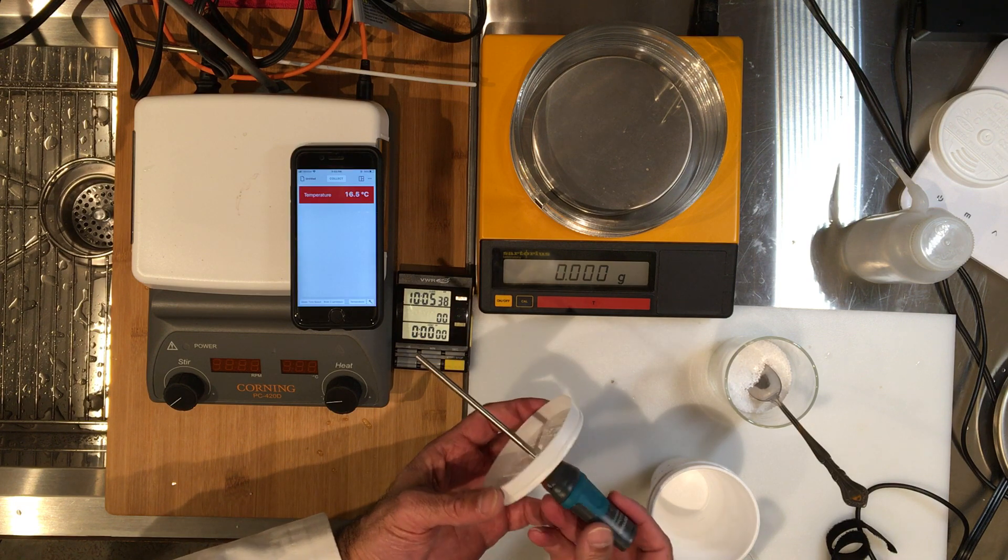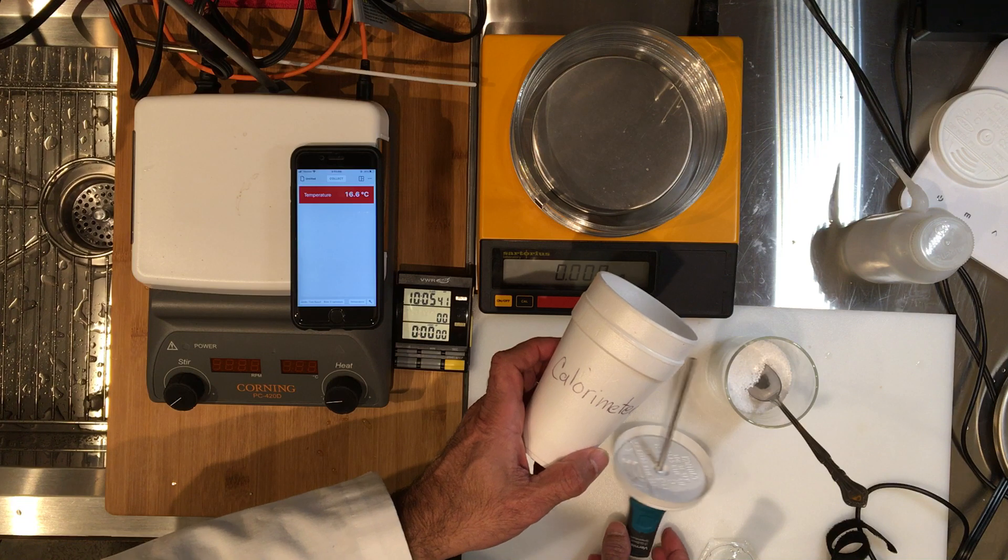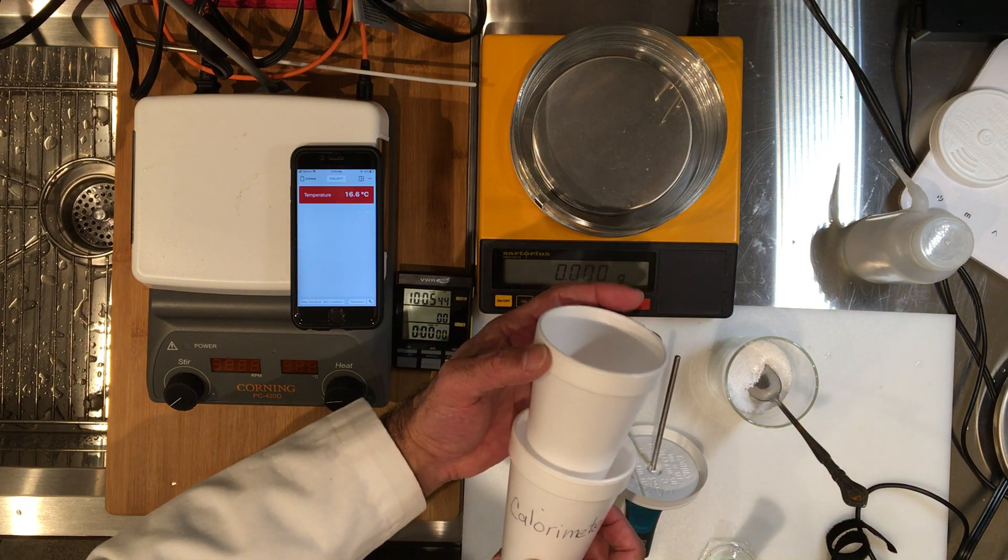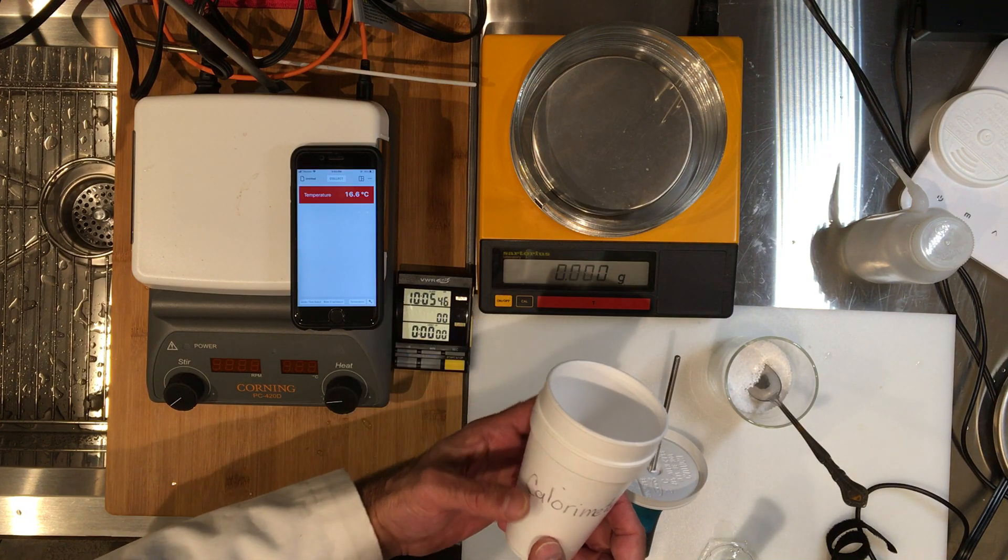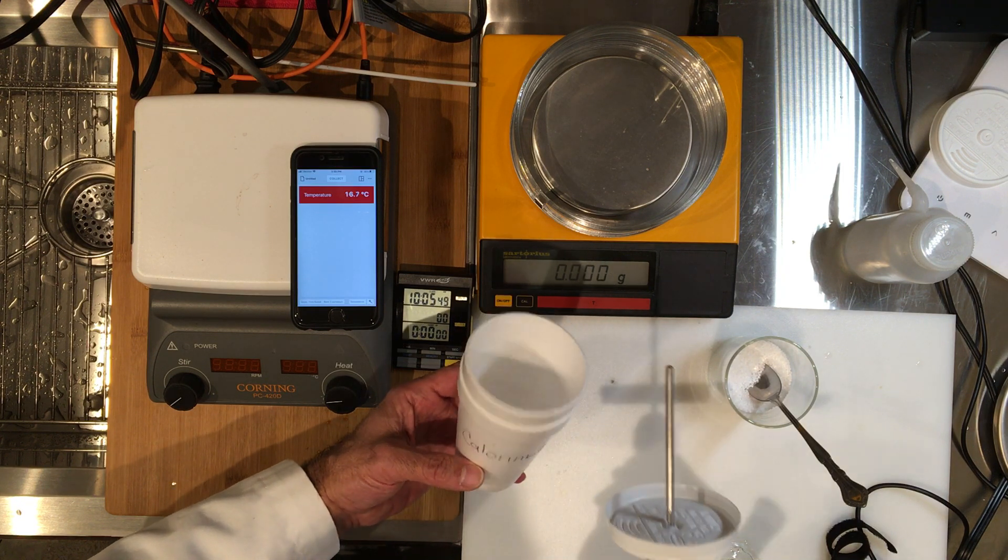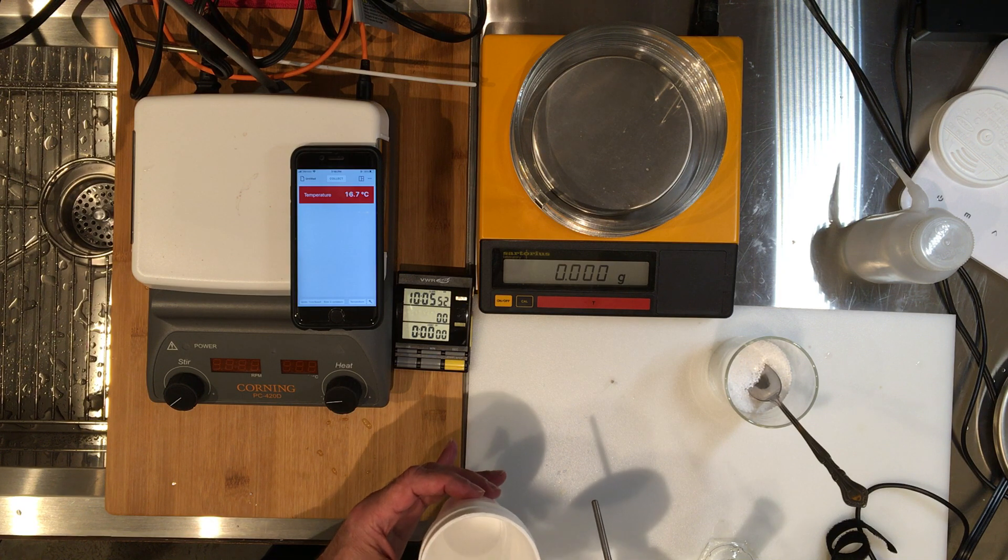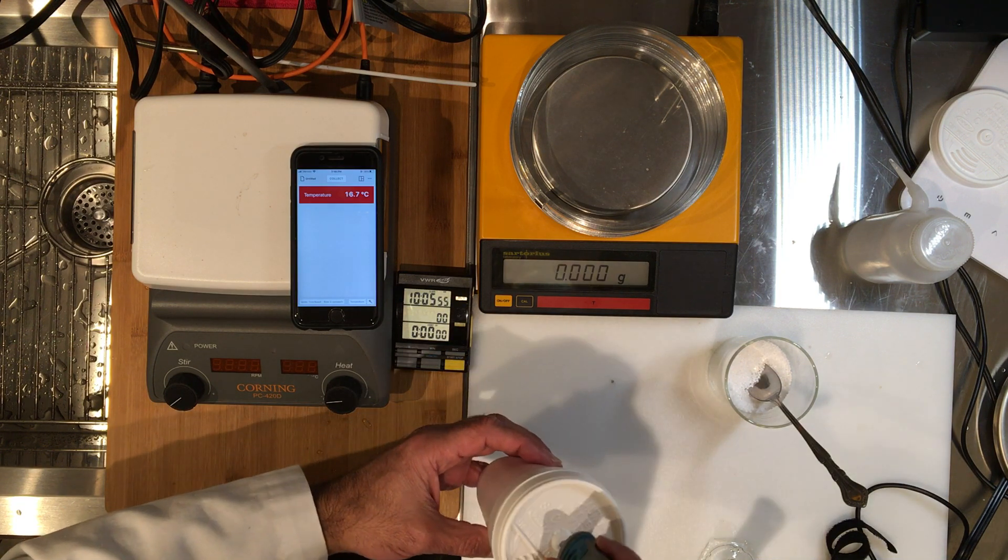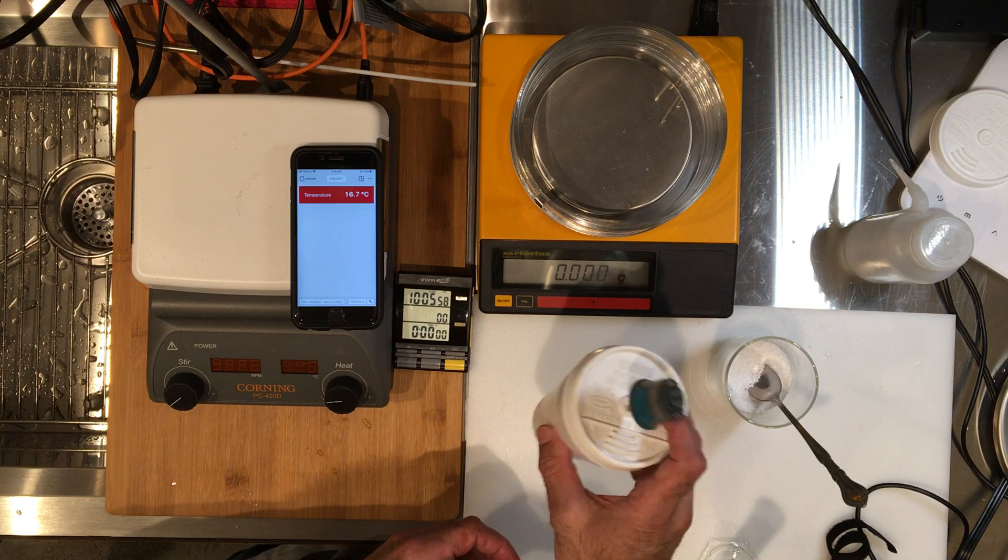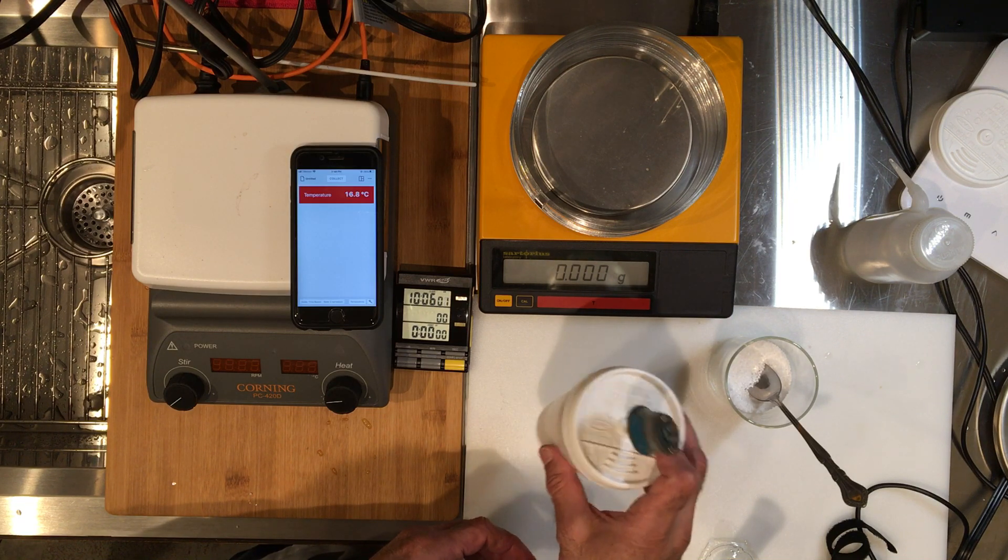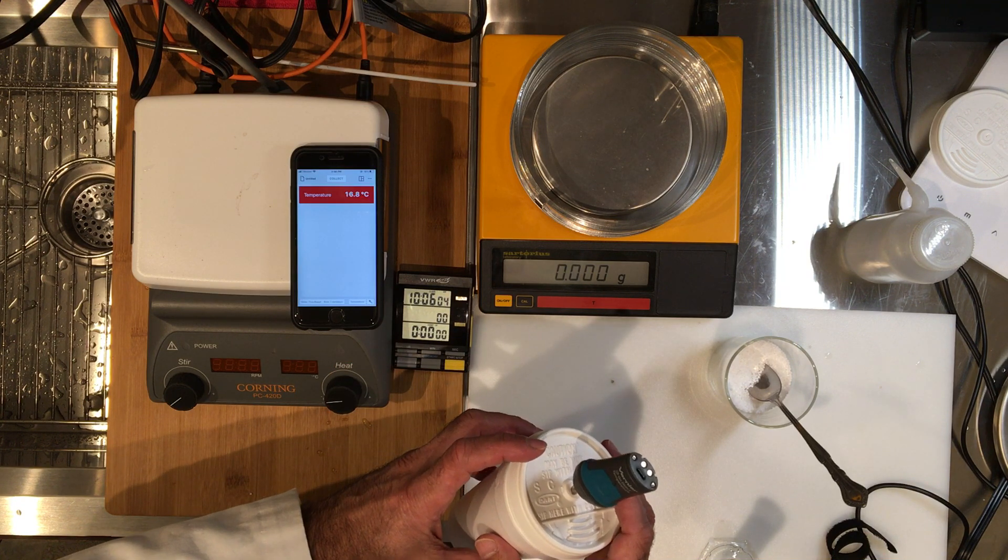This is just a basic styrofoam calorimeter. This is just two cups doubled up together to give you better insulation. The idea is to pour the chemicals inside, start the timer, and the reaction starts. I'm going to be measuring the temperature while mixing. So my job is to mix for you and your job is to record the temperature and time.